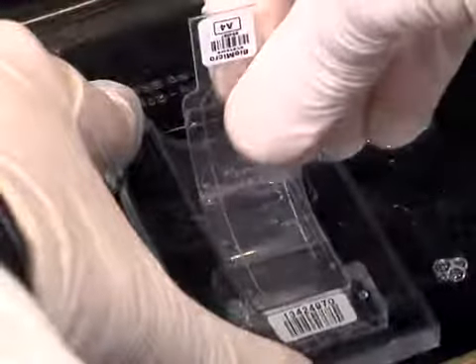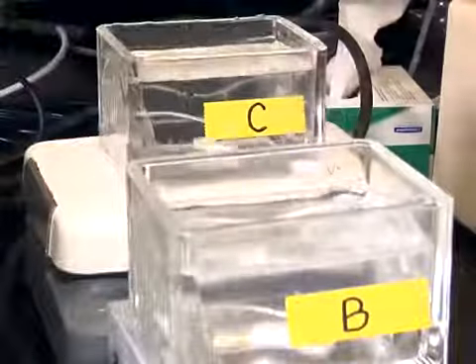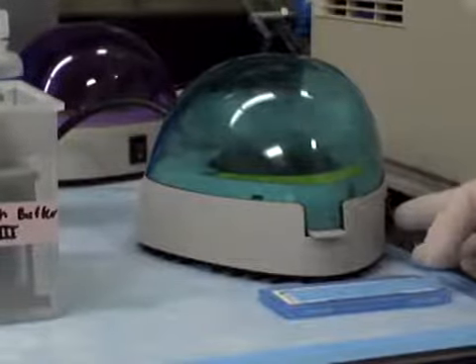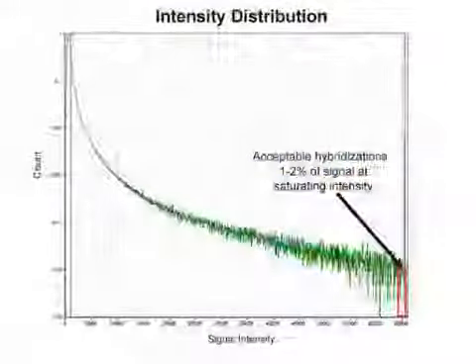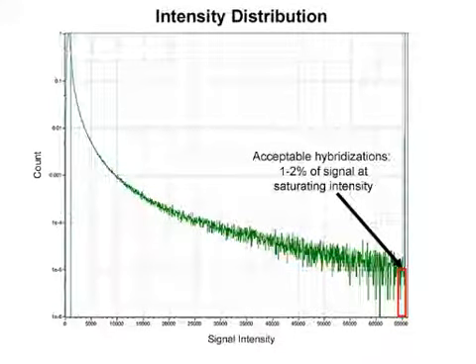After hybridization, the mixer is removed from the chip. Unbound sample is washed off, and the array is thoroughly dried by centrifugation in a specialized slide-holding centrifuge. The dried chip is inserted into a microarray scanner, and the machine is adjusted so that the brightest signals observed on a chip are not oversaturated. The microarray is then scanned and an image of the entire chip produced.